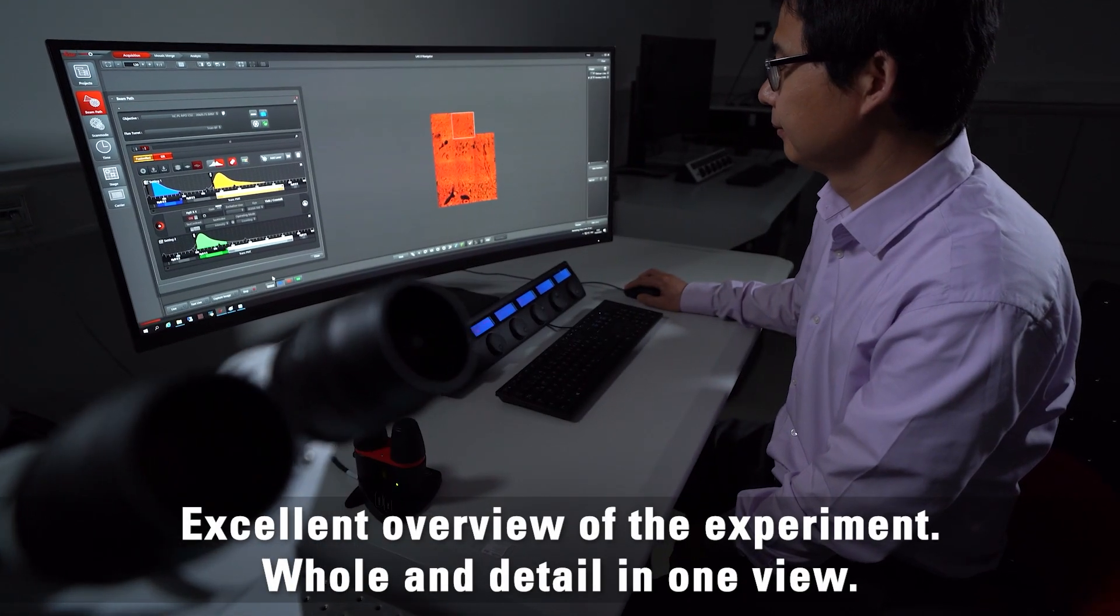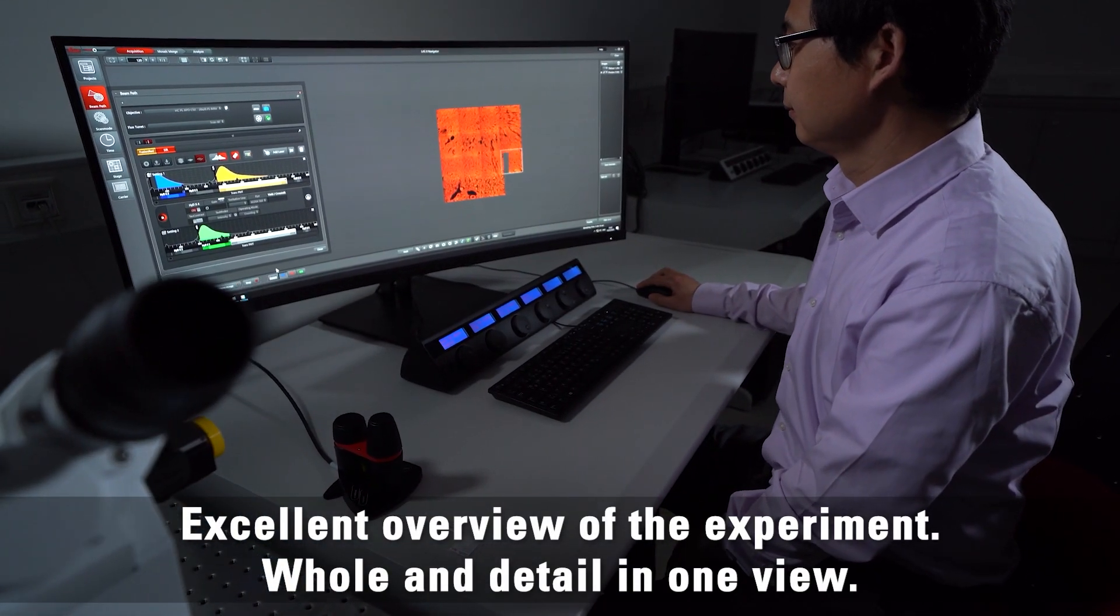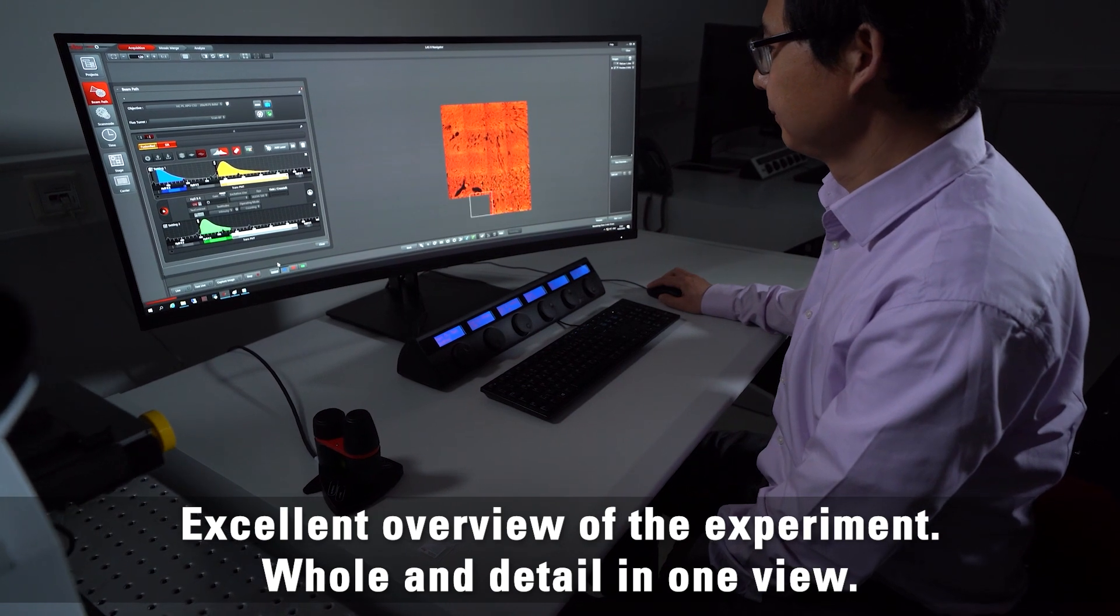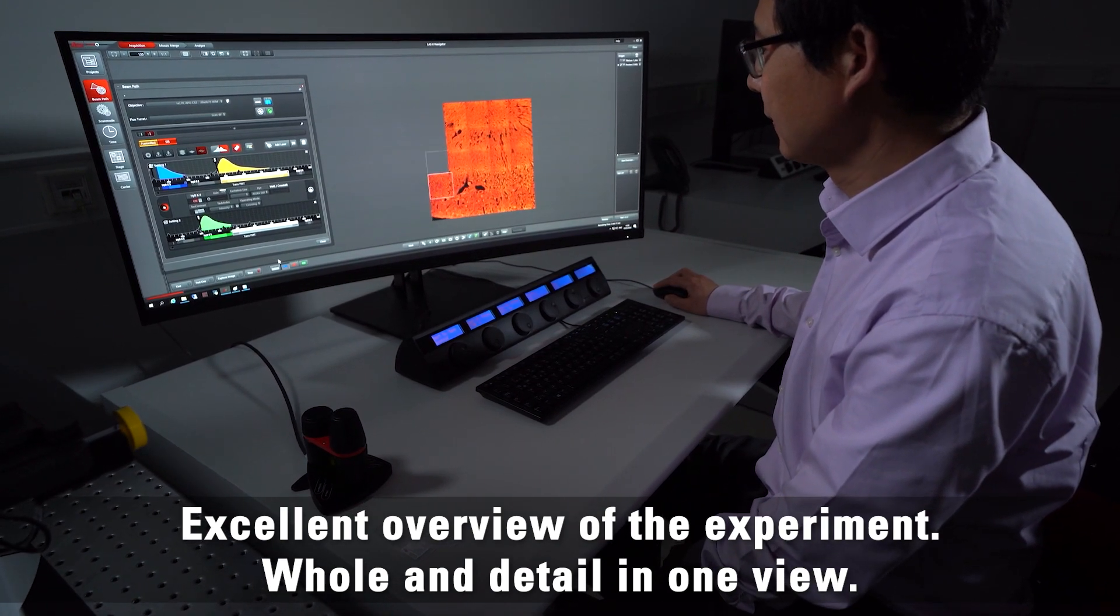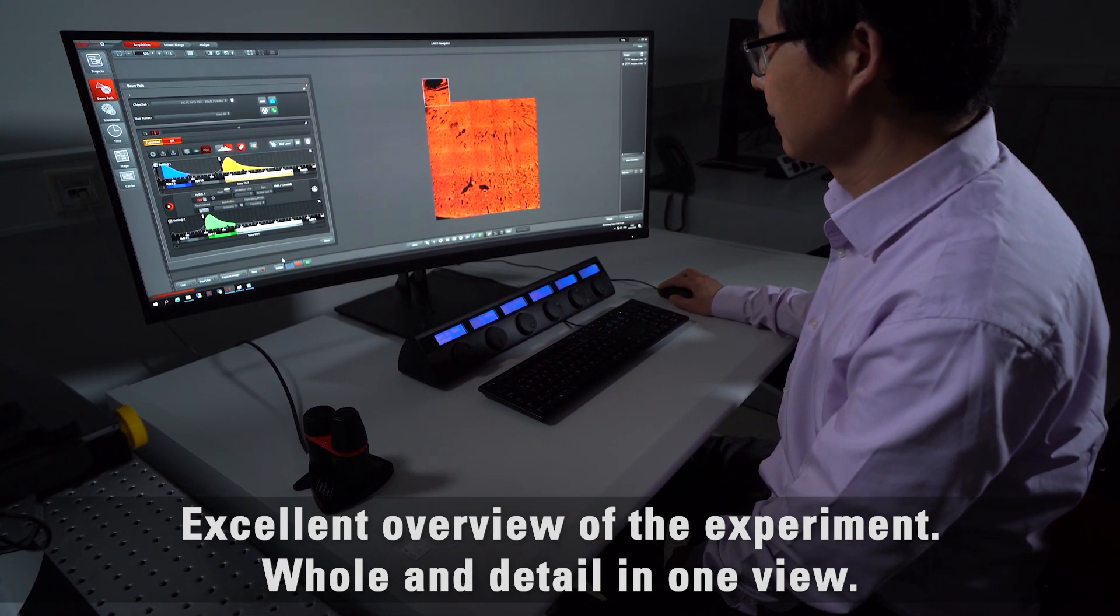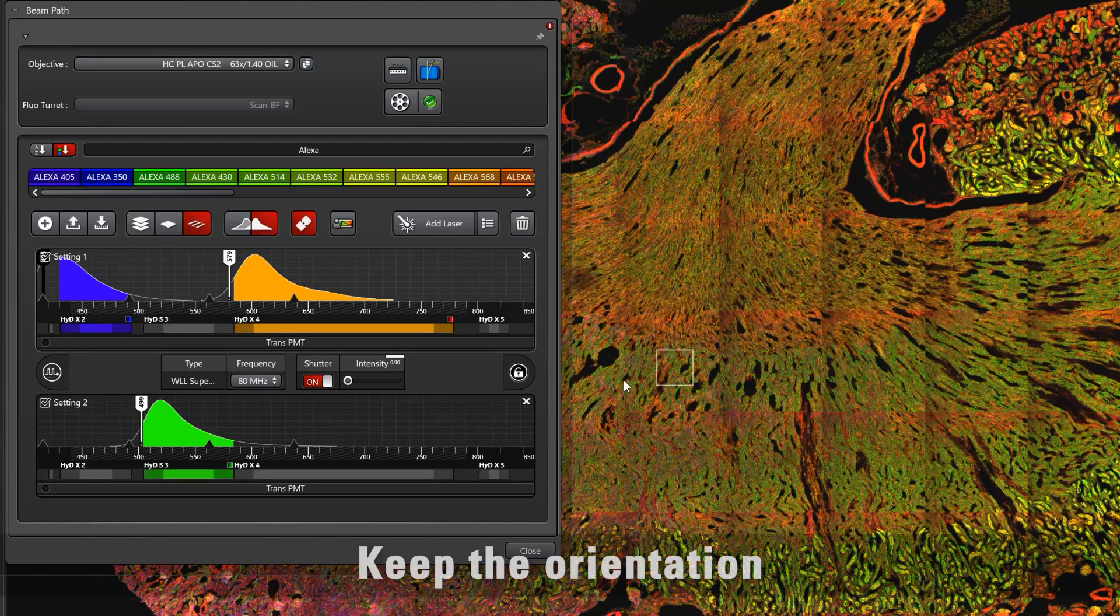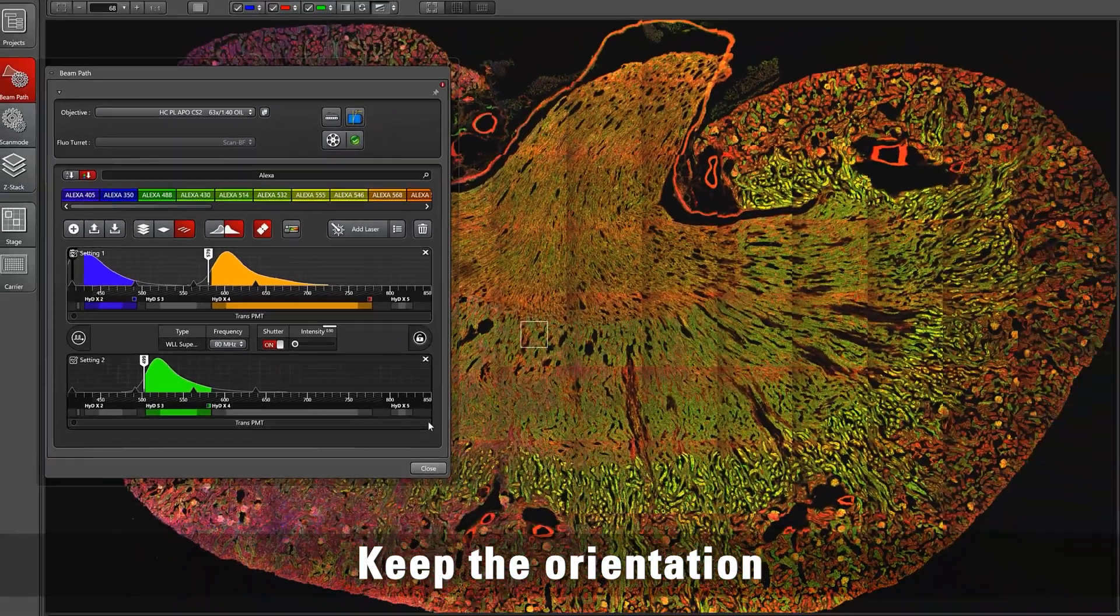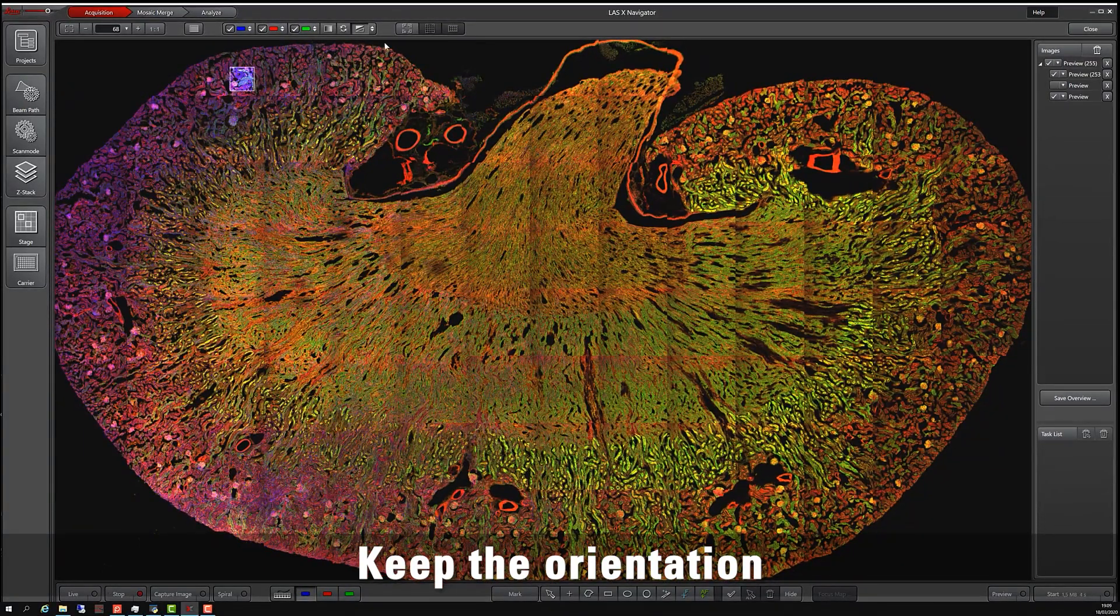The LASX Navigator user interface combines images of your sample showing various levels of detail into one single view. Like a GPS for your cells, you always have a clear orientation for your imaging experiment.